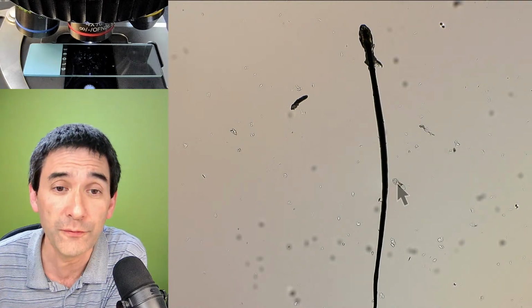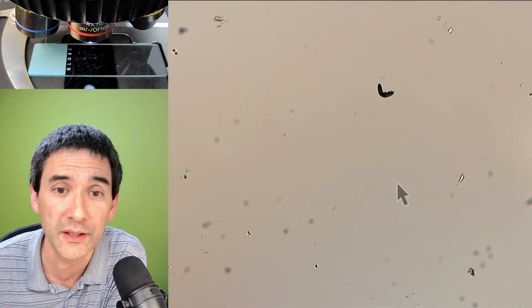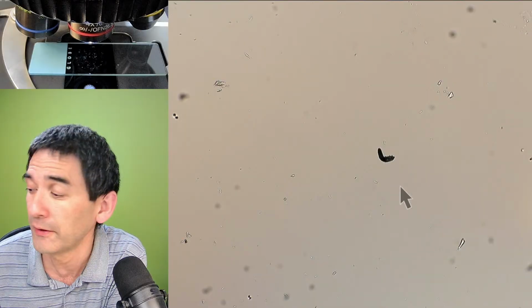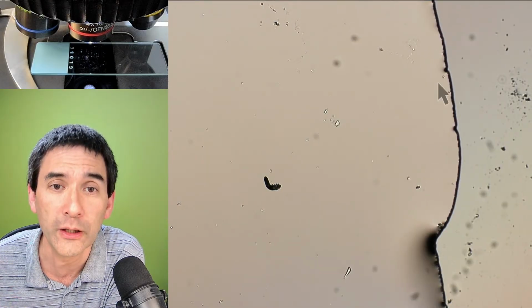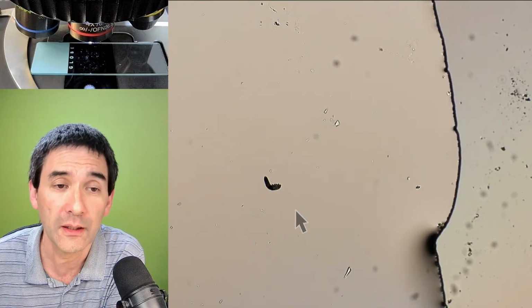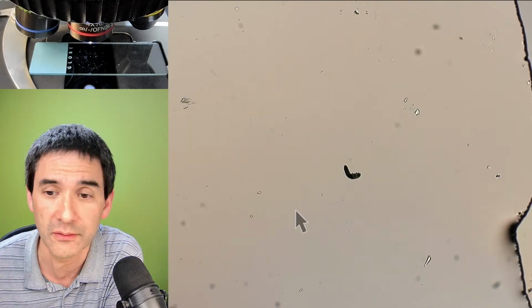And the third face mite that I have got is over here. Yeah, that's the one that I had some problems finding, right? So this one is also alive. So we can go up again with the magnification. Here on the side, what you see, that's the edge of the oil droplet. So I've got some vegetable oil, some cooking oil in here. And I'll show you basically how I'm doing that, okay?